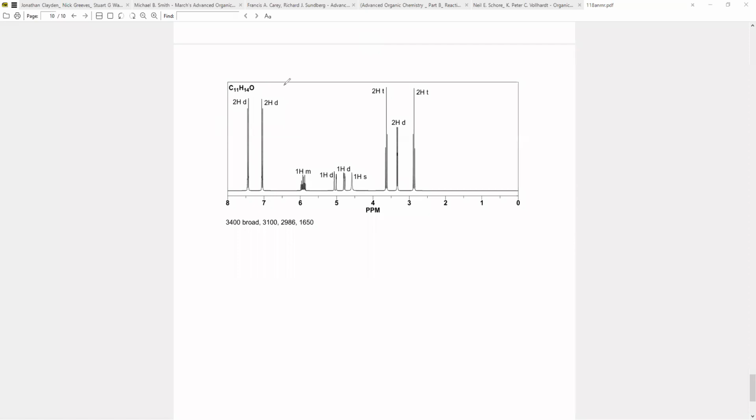So let's just talk about the benzene real quick. We have 4 hydrogens, 6 to 8. You can kind of ignore this one. You can tell that these are aromatic, they're 7 to 8, so there's aromatic stuff going on. But this is if we have 4 hydrogens, and again there are 3 scenarios for how those 4 hydrogens might orient themselves. I'll try to go from easiest to hardest.